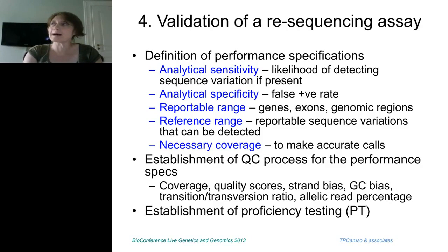They will have some guidelines, so you don't start from scratch. You can actually know, okay, I need this sensitivity or that many genes I can report probably, so let's see if we can get to the maximum, or we'll have to settle on a little less than what's been reported.